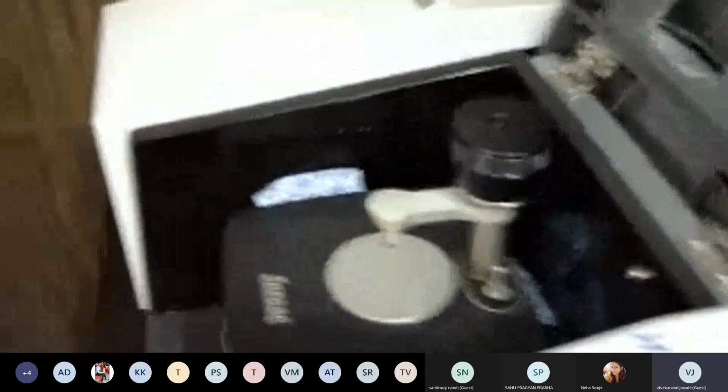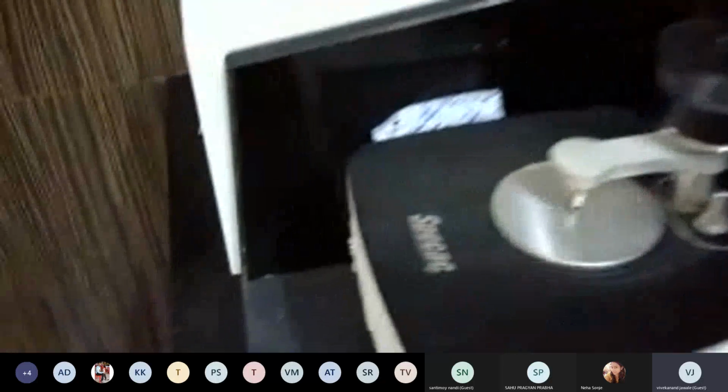Now this whole assembly has a certain surrounding, and if we do not close it properly, or do not place silica bags over there, there is always a chance of capturing moisture. That is why we keep it in a closed type of system. We have already set up all the things. Now we just have to give the commands. See here, on the right or left-hand side of the computer, there is a background.